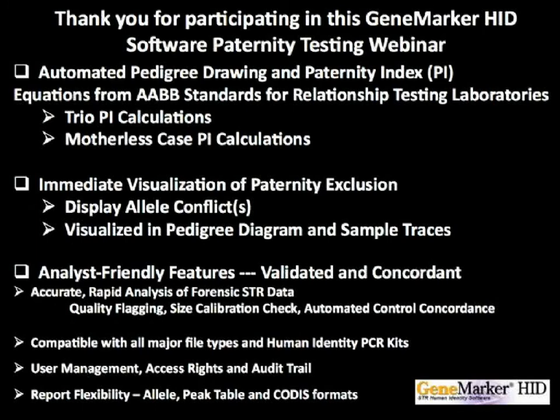Thank you for participating in this GeneMarker HID software paternity testing webinar. The program has automated pedigree drawing and paternity index calculations using equations from AABB Standards for Relationship Testing Laboratories. These include trio PI calculations and motherless case PI calculations. The program has immediate visualization of paternity exclusion, displaying allele conflicts in the pedigree and in the sample traces.